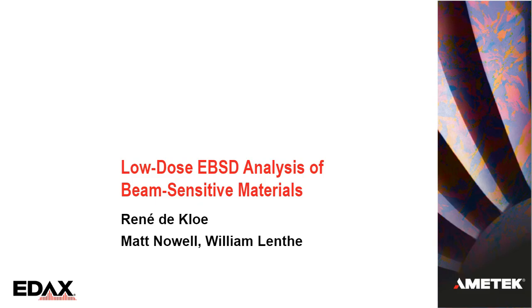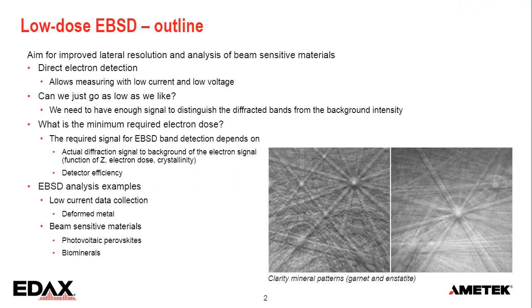Welcome everybody to this webinar on low-dose EBSD analysis of beam-sensitive materials. So what am I going to talk about today? Why would we want to do low-dose EBSD? Because we have very fast cameras nowadays. We can go very, very fast, thousands of points a second. But to do that, you need higher currents, bigger beams to give you some signal. Not all materials can accept those kinds of beam conditions.